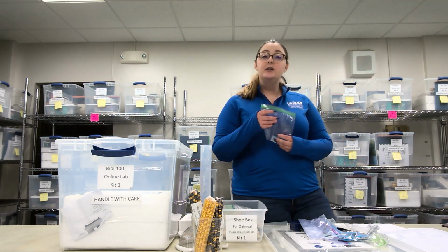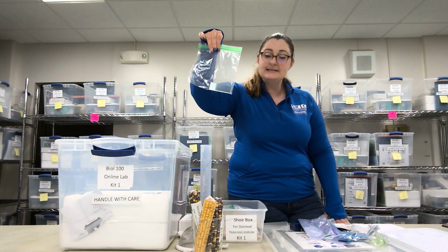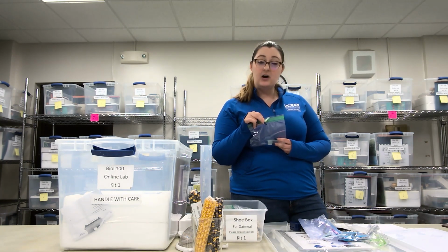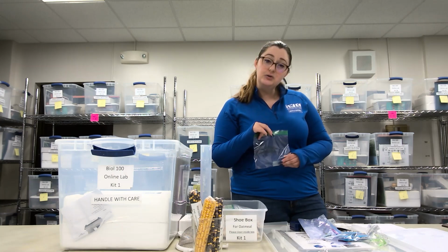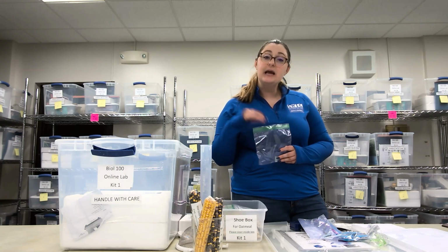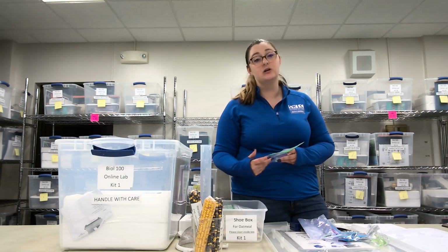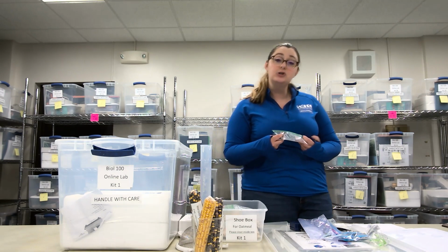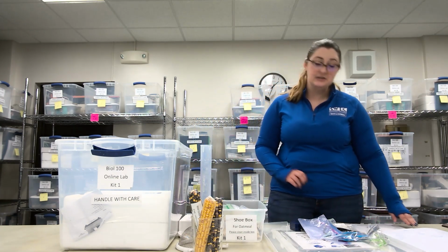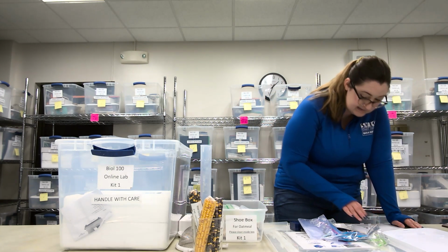From there, you should find an unlabeled bag of glass slides. So these are slides for a microscope. They are empty. Once you have used one, you will not clean it and put it back. You will use it and then throw it away. Please only use one or as many as the instructor is informing you to use, which should just be one. We're going to put that into the shoebox and check off our bag of glass slides.